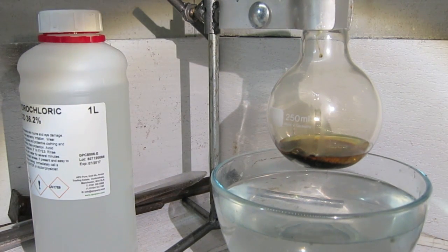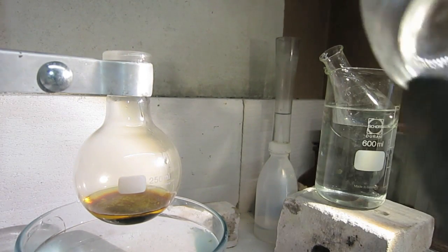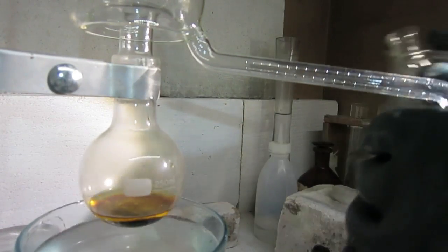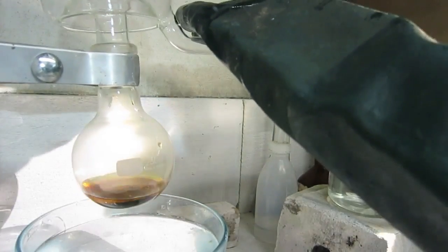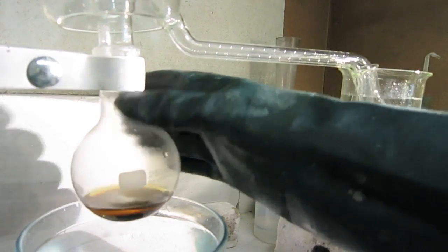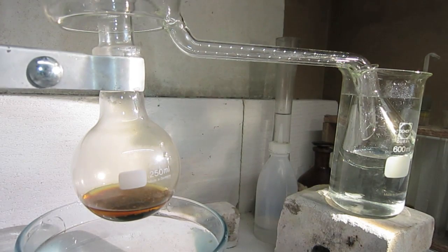Let's first clean up the pipette. Okay, once the distillation. Let's set it.